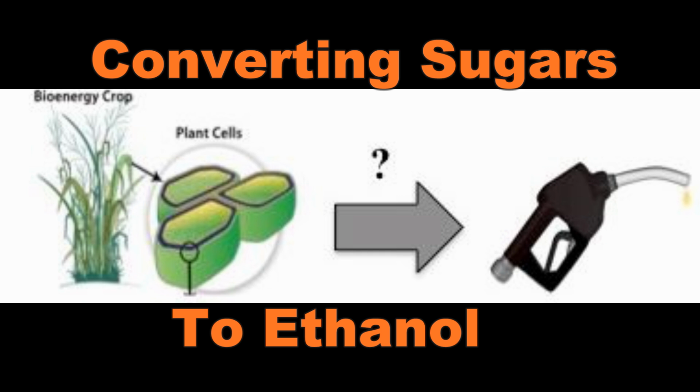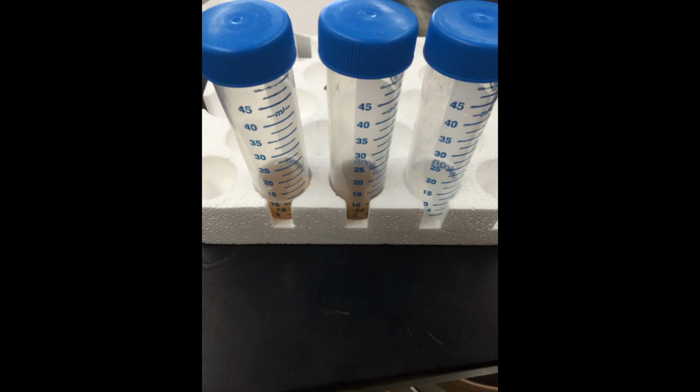Ethanol is one of the most predominant liquid biofuels produced via biological conversion of renewable biomass. It involves yeast and, to a certain extent, bacteria to produce ethanol from pyruvate. For every 1 mole of glucose, 2 moles of ethanol and 2 moles of carbon dioxide are produced. In this lab, you'll investigate the fermentation process for converting cellulosic biomass into ethanol, finishing what was started in the pre-treatment/saccharification lab. Next, let's move on to the setup of the lab.